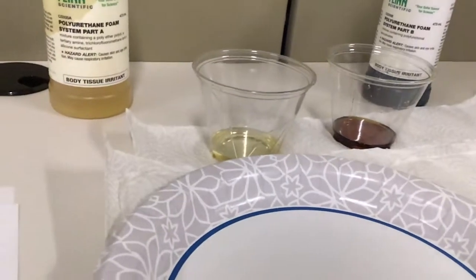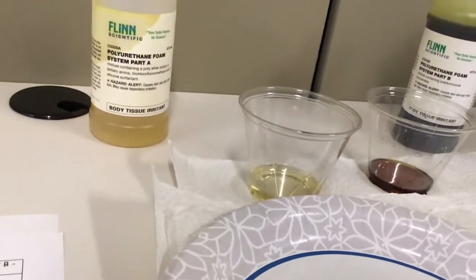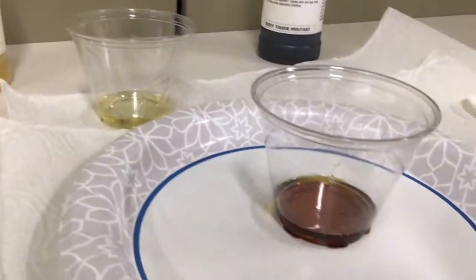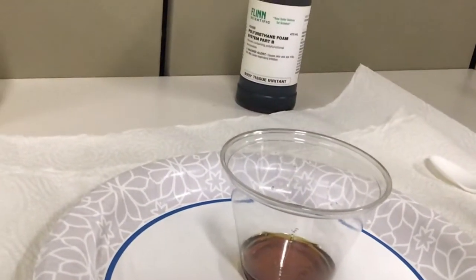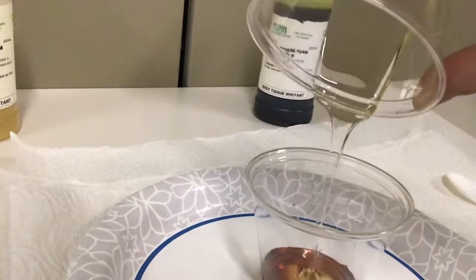So it says that we will be pouring chemical A into cup B. So this is cup B, and I'm going to be pouring this in, and then it says to stir vigorously for about 30 seconds after I mix them.